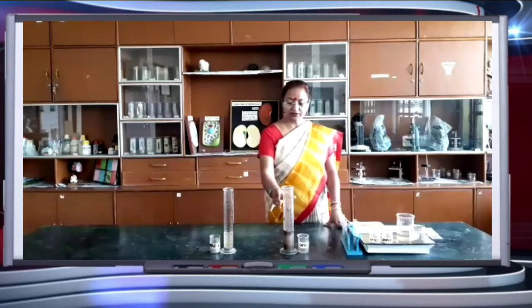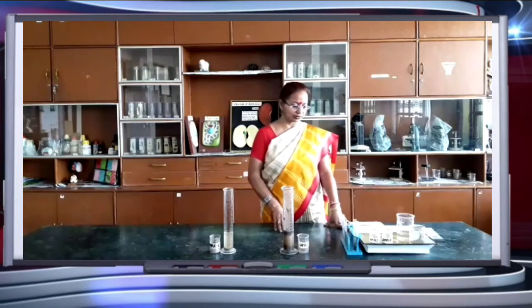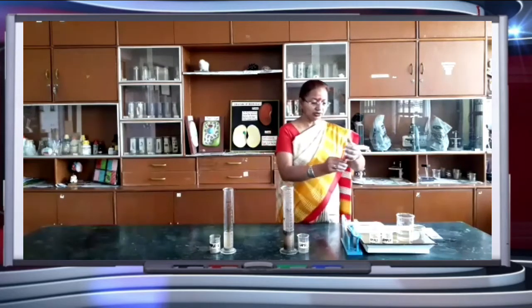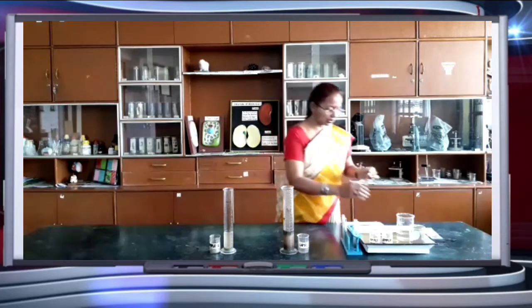We will leave this soil for 10 minutes. Meanwhile, we will check pH of soil in 3 different samples of soil. Now children, these 3 test tubes, I have already prepared with the samples. So this is sample 1 we will consider, and shake it well because we have to check the pH of soil.